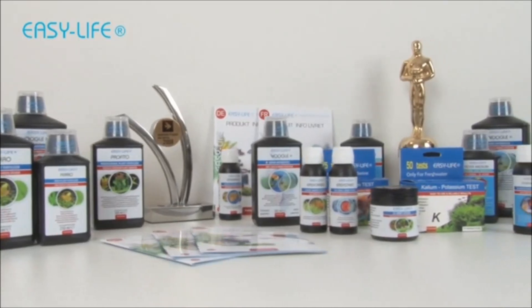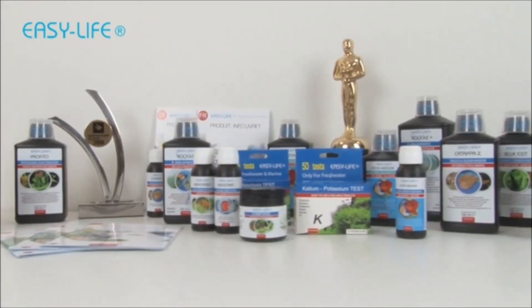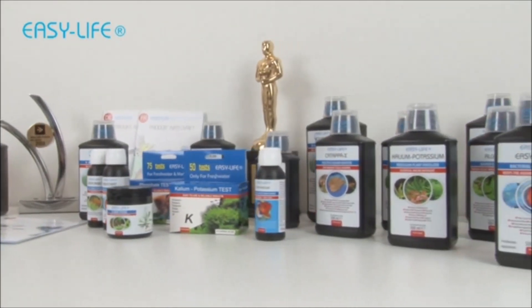Today we're going to explain the use of the unique EasyLife Kalium-Potassium test kit with ColorChart.